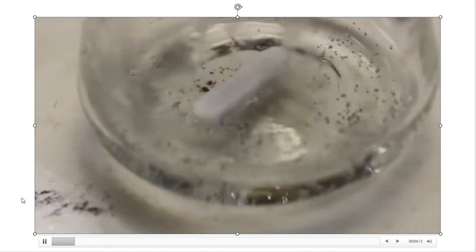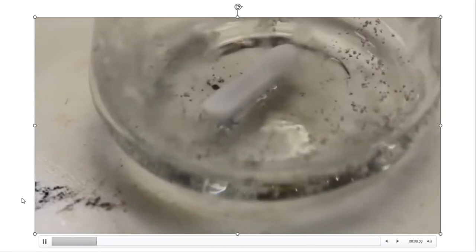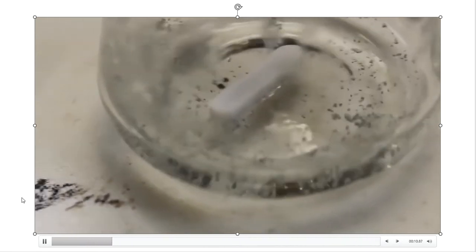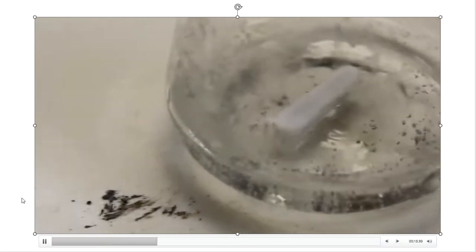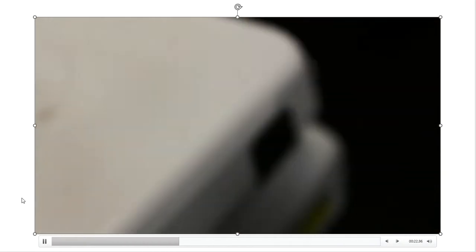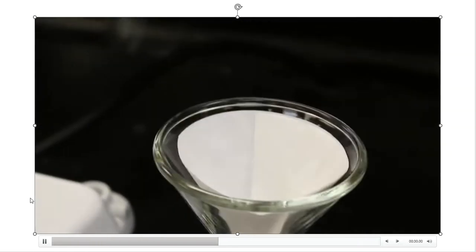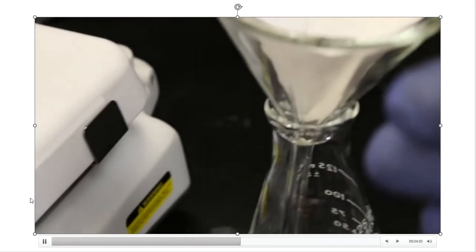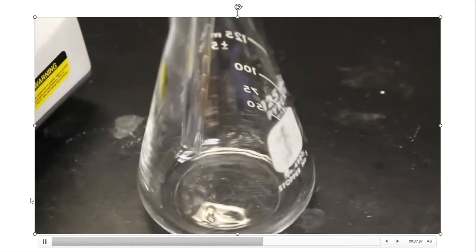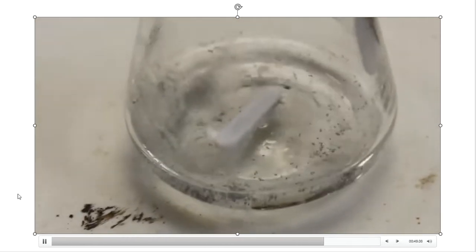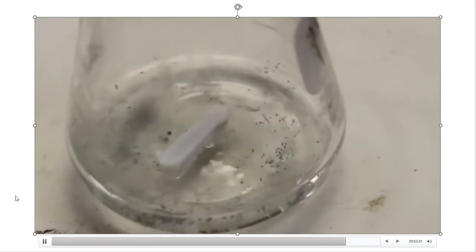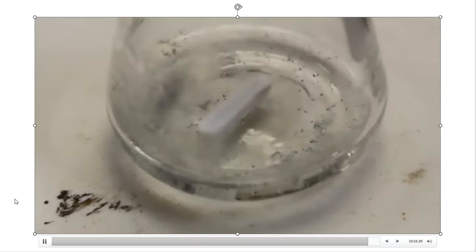We're almost at boiling — not quite, but close. What's visible in the flask is remaining zinc floating around — not the product we want to keep. We need to filter it out. The plan is to filter this solution through a normal filter paper folded in a funnel into a new 125 mL Erlenmeyer flask, to get rid of all this remaining zinc and prevent it from contaminating my product.